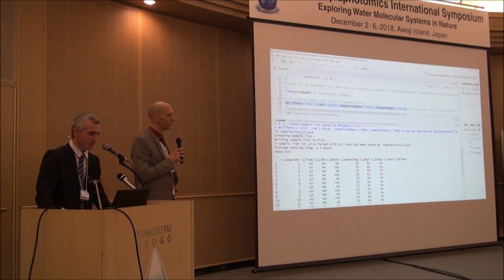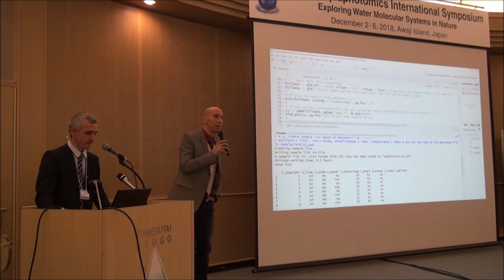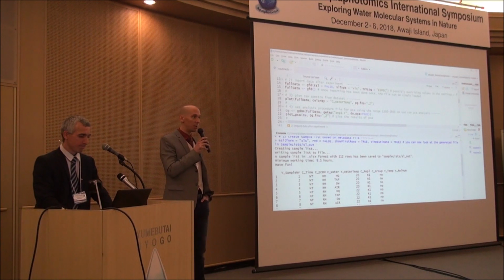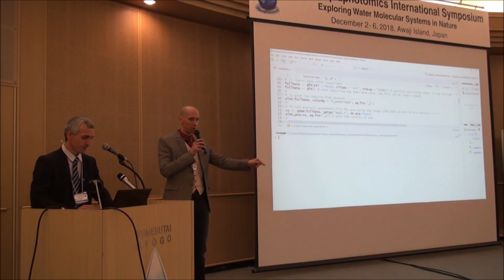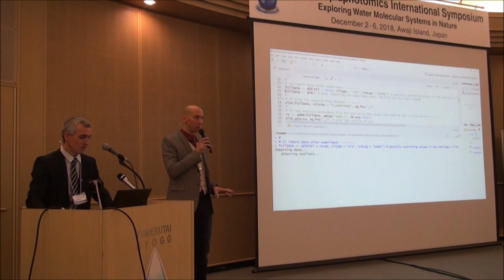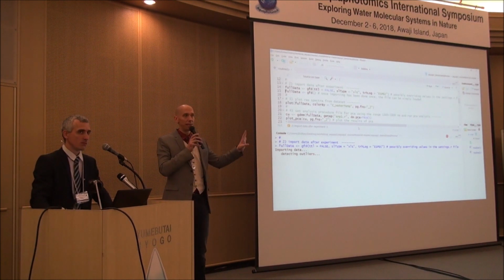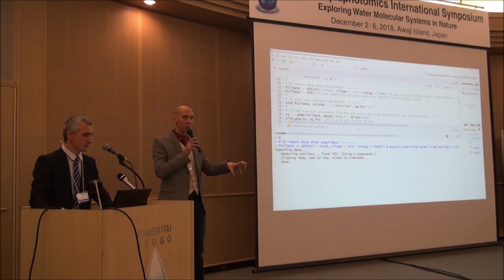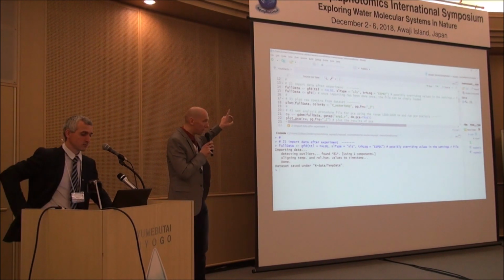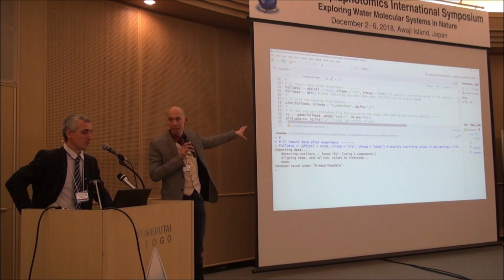After this, the next step. Of course, all these formats, the raw spectra and the temperature logger data, they can have many different forms. Some of them are already implemented, so you can just say, I have this or I have that. You can have text files, Excel files. You can make your complete custom import by plugging in a function for the pros who are interested in that. Just saying, we think this is a quite powerful tool to import any kind of data into aquap2. And we are now focusing on this specific example where we already provide the test data.